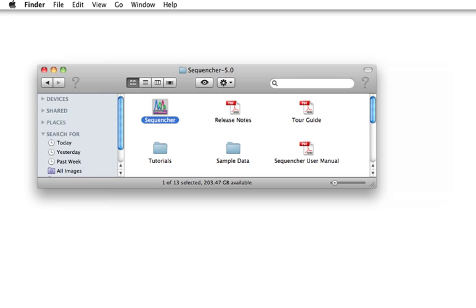Hi, I'm going to give you a short introduction to using some third-party tools with Sequencher 5.0 to accomplish next-gen sequence alignment.